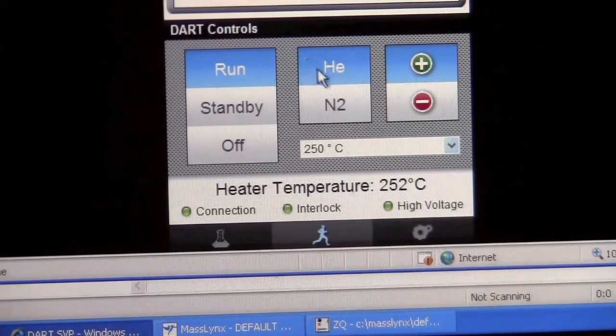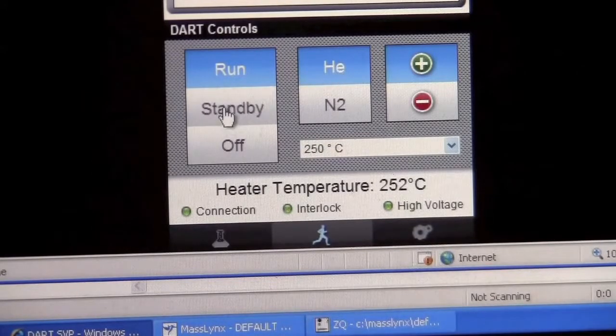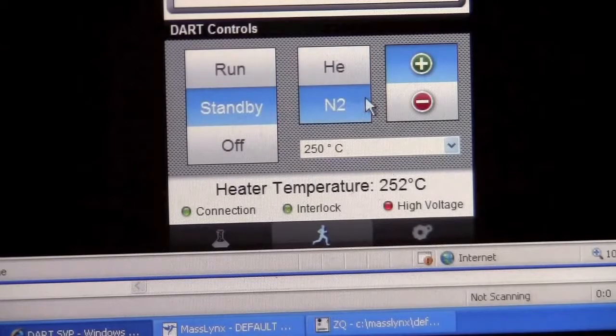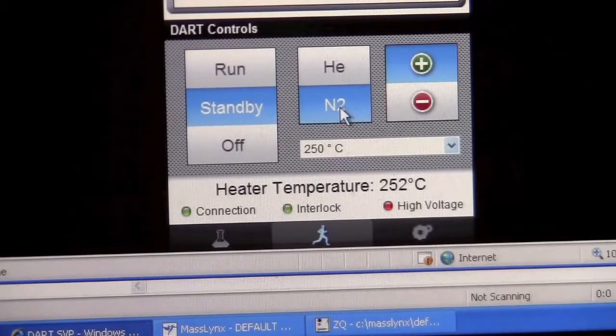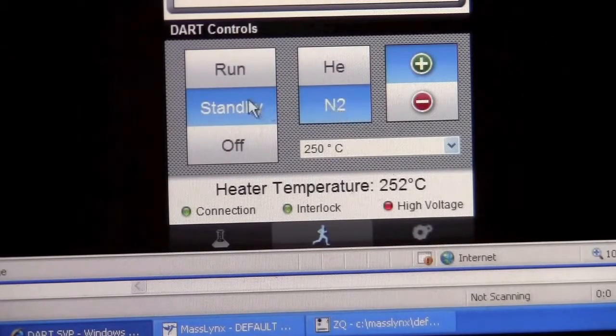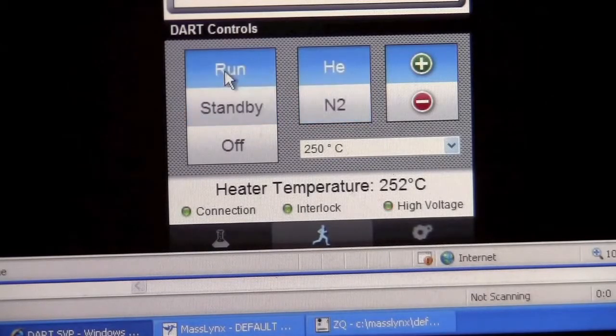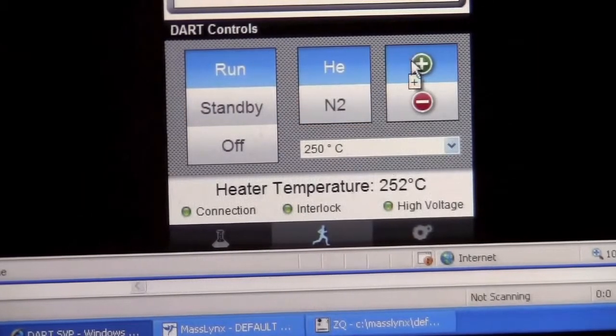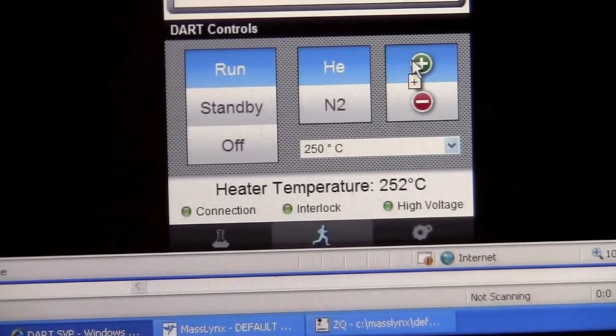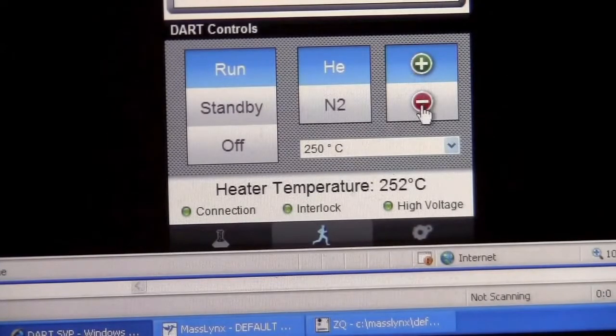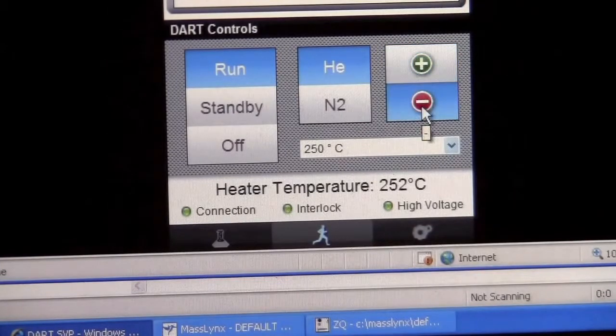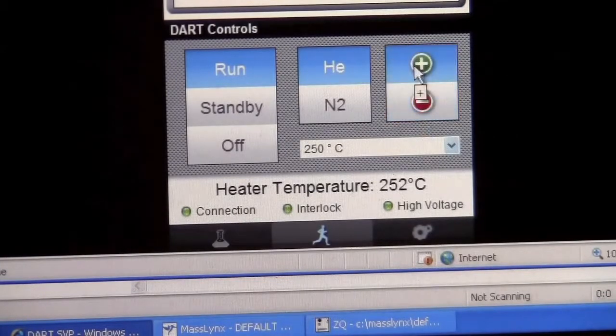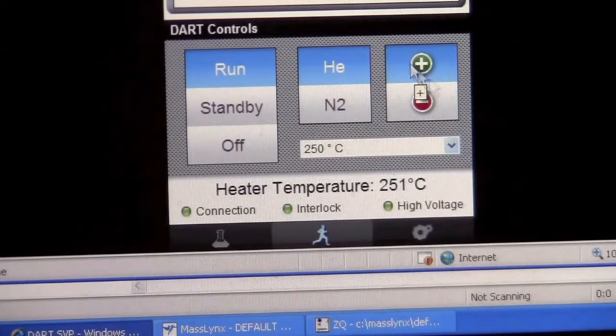So when you're done running, be sure to put it back in standby mode so we are only using nitrogen. While it's running, we can switch it to positive ion mode or to negative ion mode. I'm going to show you positive ion mode right now.